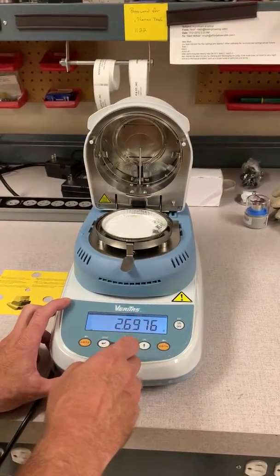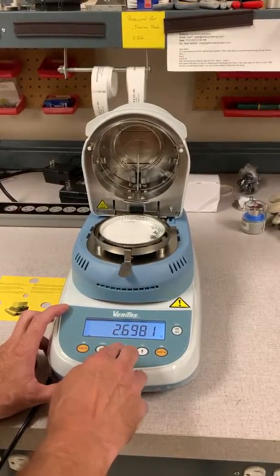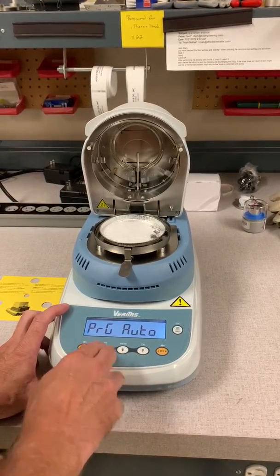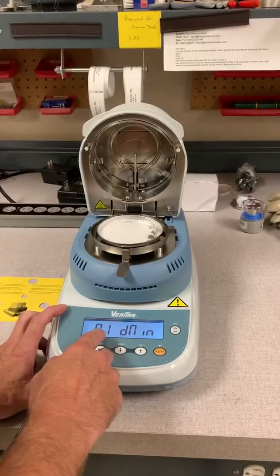We have a prepared sample loaded in the chamber. Press the menu button, select measure, press print. We're going to run an auto test — press print to select. Now comes our rate.